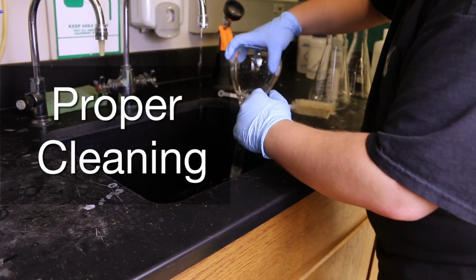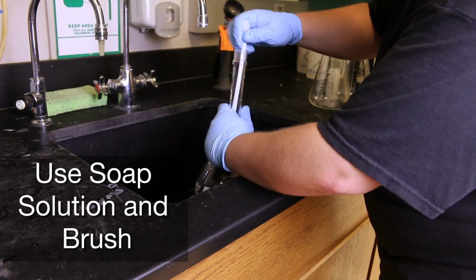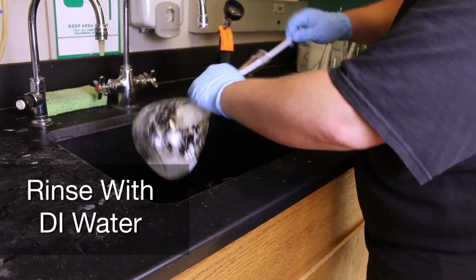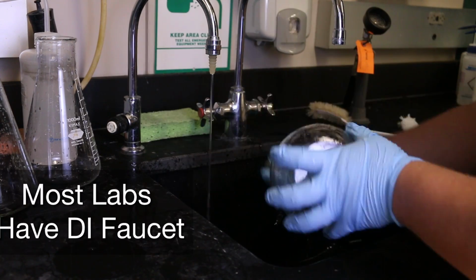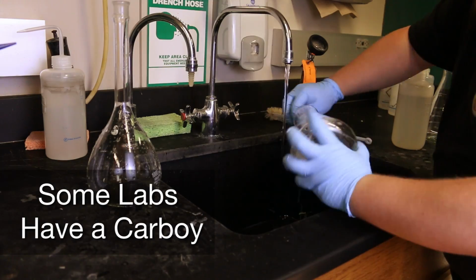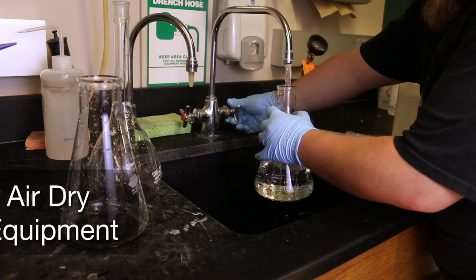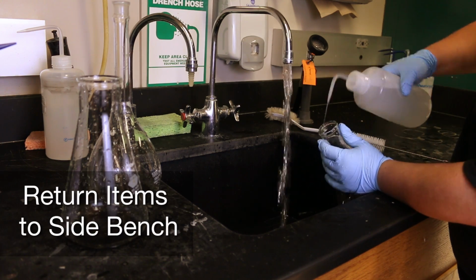You will also wash your glassware and equipment at the sink. To properly clean the glassware, use the soap solution and a brush found at the sinks. Use tap water to wash and then rinse the soap off. Once the glass or other equipment is clean, rinse it with deionized water, also known as DI water. Most of Grand Valley's labs have a faucet of deionized water on the side of the regular tap water. Some labs will have a carboy of deionized water on the side. It is important to rinse all glass with DI water after it has been cleaned. Once cleaned and rinsed, air dry the equipment. Either return it to the common area side bench or the lab drawer or bin where you got it.